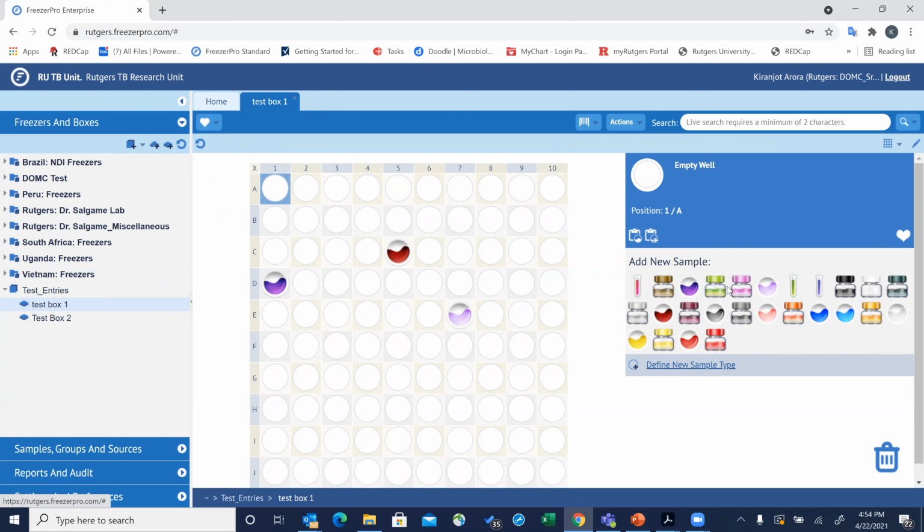So the teams that are working on just the FEN-TB adult study, for example South Africa, which currently does not work with non-PED-FEN study samples, will only be able to see the samples that are specific to the FEN-TB adult protocol. If you bring the cursor on top of these different icons, you will be able to see what the sample type is and which study it belongs to.